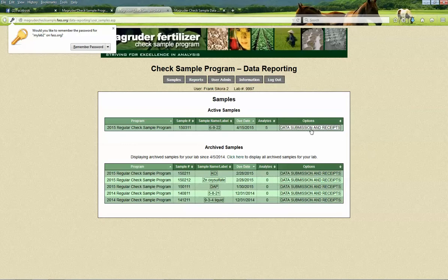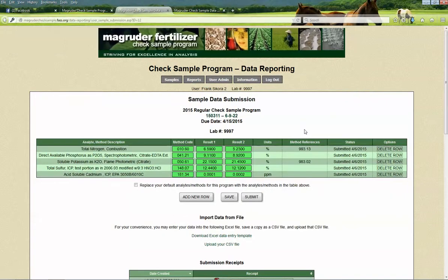I go to data submission and receipts for the active sample. And this is data I've entered in the previous instructional videos for the analytes and methods. And let's say I want to submit this data for final analysis, statistical analysis. I've done a final review of it.